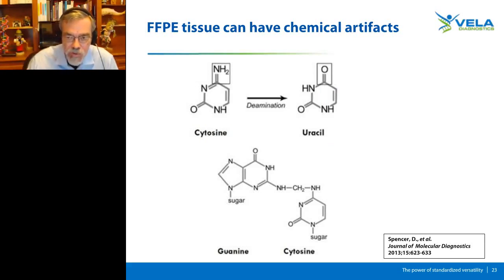So variant analysis really begins with the tissue and how it's handled and processed in the operating room and in the pathology lab. FFPE, or formalin-fixed paraffin-embedded tissue, is the most common way tissue is processed. When working with DNA and RNA samples, it's important to use neutral pH buffers and avoid aging the blocks more than necessary, as this will affect the results. FFPE can cause a number of chemical changes in DNA and also in RNA, including deamination, oxidation, cyclic base derivative formation, and methylene cross-link formation. In FFPE tissue, nucleotide transitions can occur.